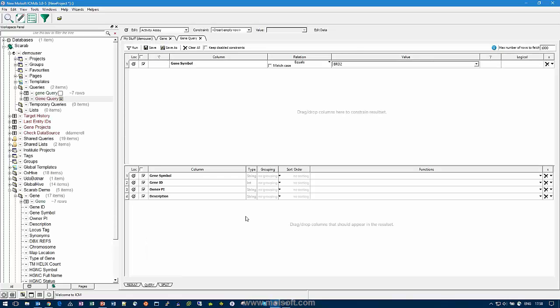and then it will run the query. The query is actually still there. It's in the back end here, but I left it blank. So that's a parameterized query. There can be multiple parameters that are not filled in. So this is a way of doing template queries, if you like, and you can put in the information ad hoc and modify the query that way. Hopefully that answers your question.